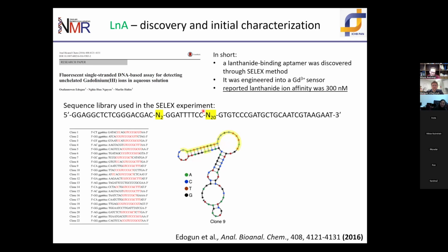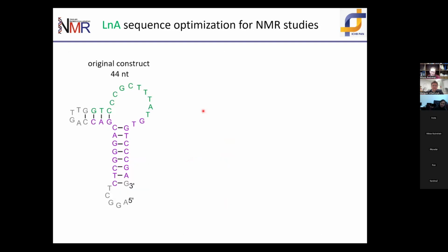In a way, because I hope that I showed you that the structure that we observed was much, much more than this original secondary structure made us believe. We thought that, okay, this is probably a loop, lanthanides comes from somewhere here, and the nucleotides just wrap around it. Well, in reality, we've seen that this is a much more intricate tertiary structure. Okay, thank you.